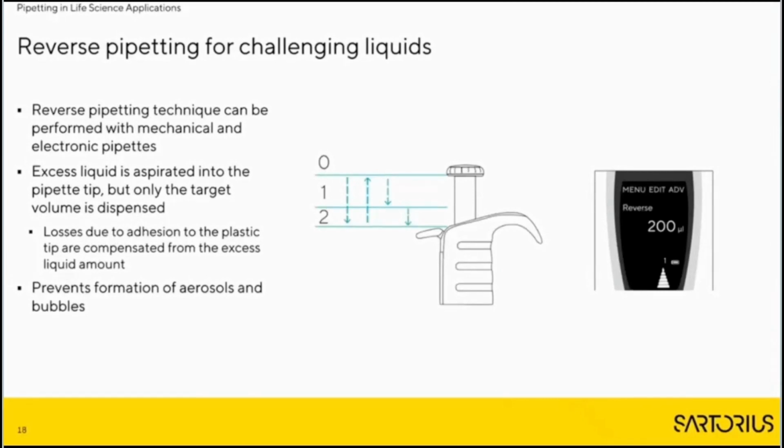So a bit about reverse pipetting, especially for challenging liquids. Please apply the reverse pipetting technique when pipetting challenging liquids, for example foaming, as Joni already mentioned, viscous or volatile liquids, or if you're struggling to pipette small volumes.